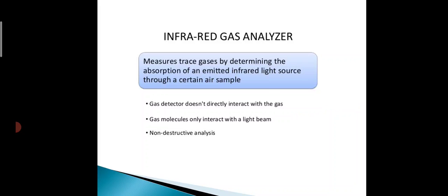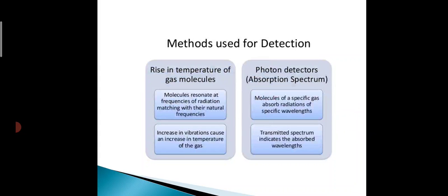The gas detector does not directly interact with the gas. This is the first point. And another one, the gas molecules only interact with the light beam, and it is a non-destructive analysis. These are the benefits of the gas analyzers. And now the method used for detection.